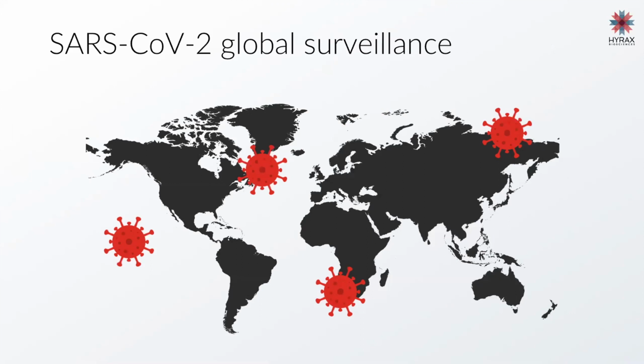Thanks, Simon. So as Simon said, my name is Natasha, and I'm just going to take a couple of minutes to highlight some of the current standards for sharing SARS-CoV-2 sequence data, as well as the tools for defining clades, lineages, and variants, which will provide some context before Imogen then goes through a demo of the Exatype platform.